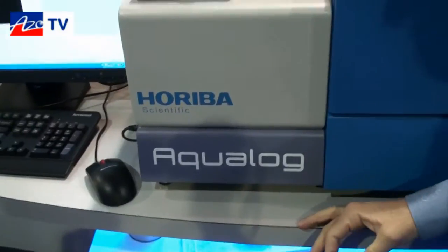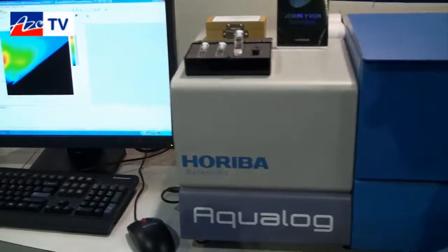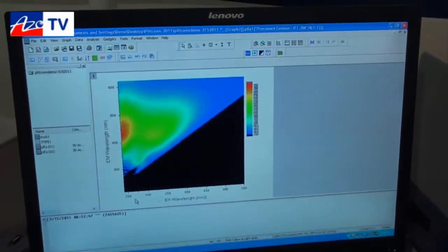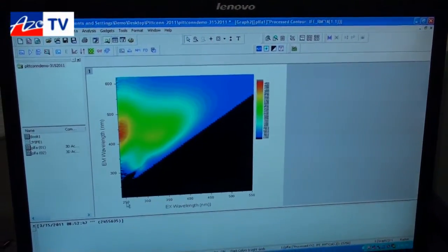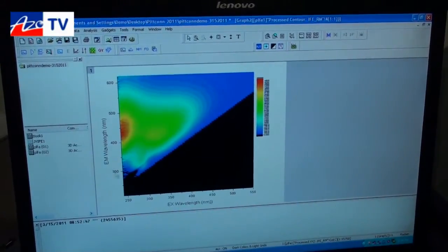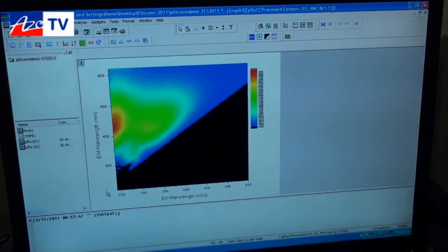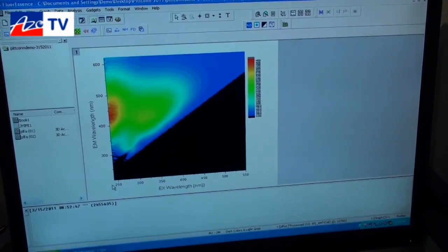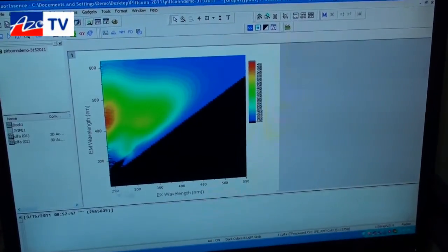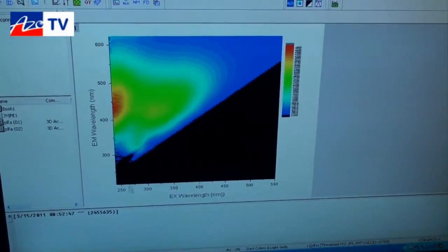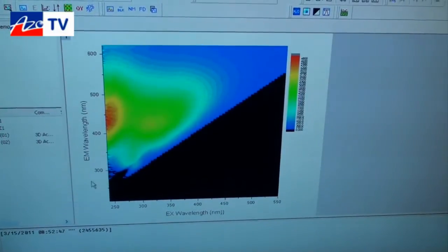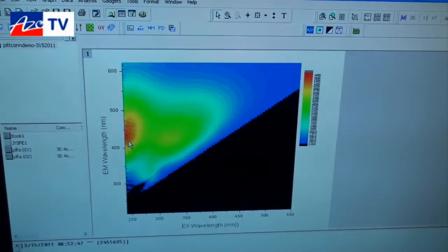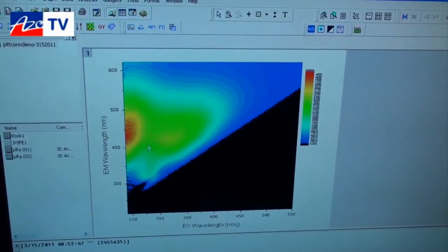I think the key aspect is easier to demonstrate here in terms of the software and the data output. The program is designed primarily around this type of instrument and experimental output where we have a scan of the exciting wavelength that the sample sees from our exciting light source, and then we have the emission spectrum that is measured simultaneous with the CCD. So we end up with a three-dimensional profile of all the fluorescent species in terms of their excitation and emission spectrum.